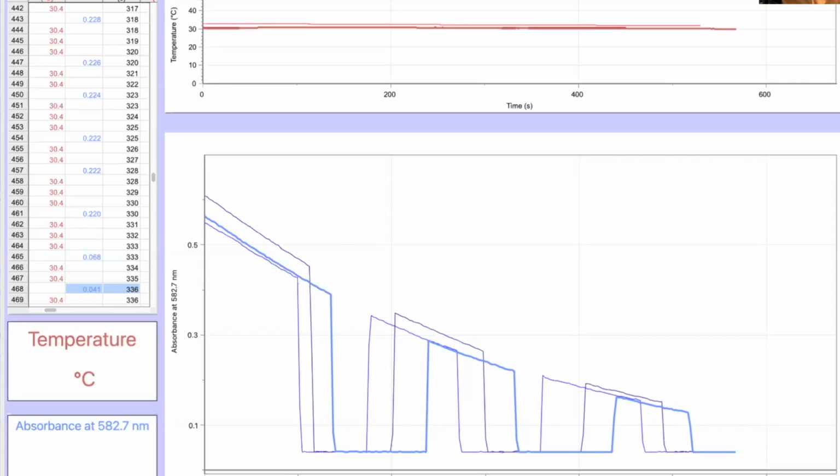Next time, I will take a data set, and I will show you how you would be able to fit it through linear regression, so that you can determine whether it's 0th order, 1st order, or 2nd order. That's what we are going to be doing next time.